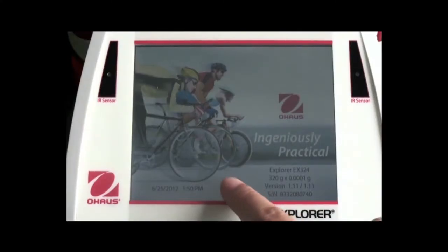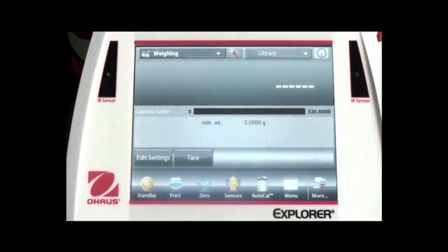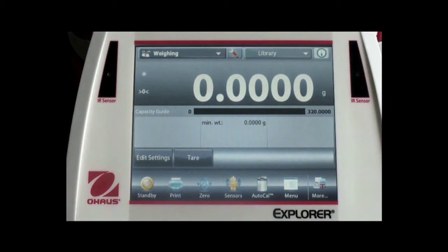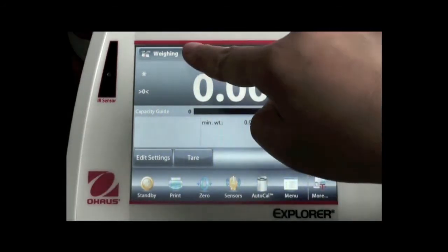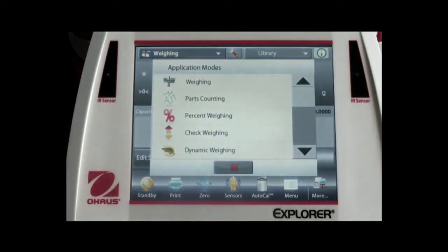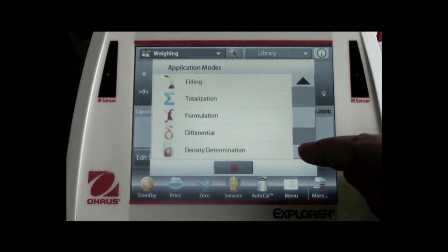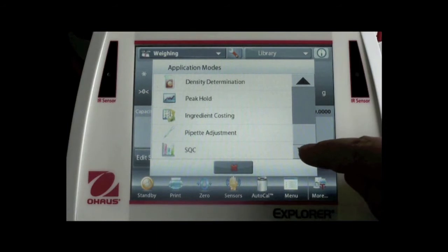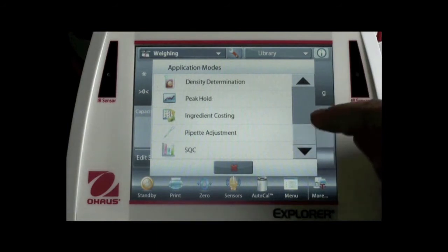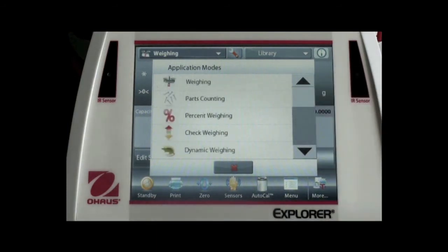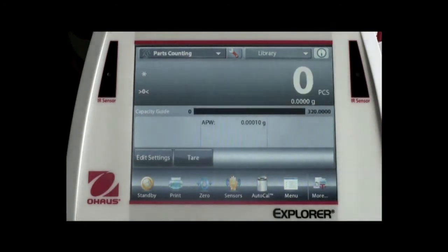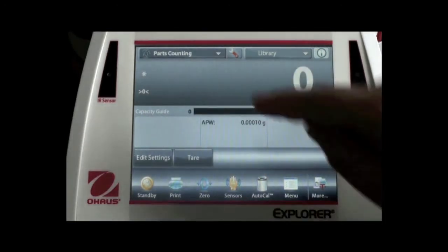When you click the yellow standby button, it goes into the main screen. The main screen consists of five areas. The top line has three buttons. The first is to select between 14 weighing applications, like parts counting, density determination, differential weighing, SQC, etc. You can easily access different weighing applications just by touching this button.